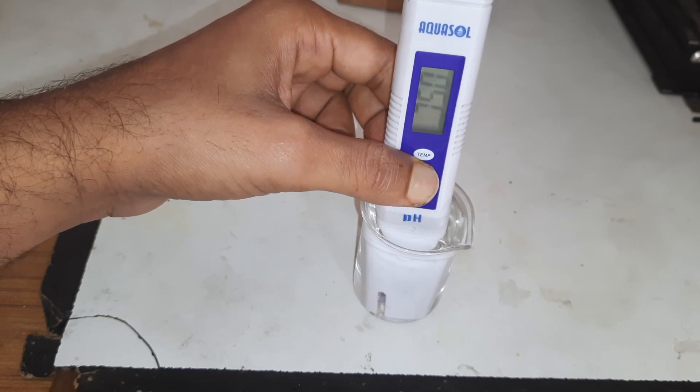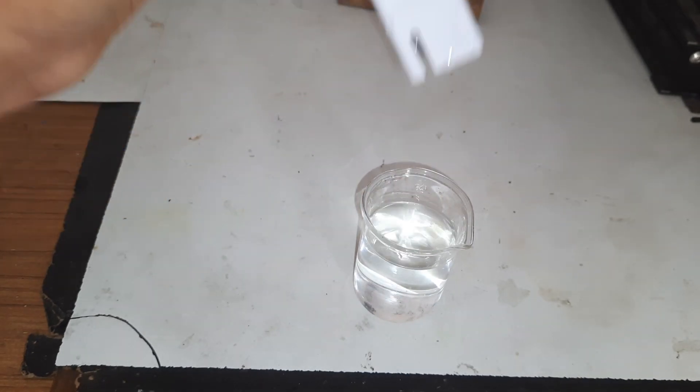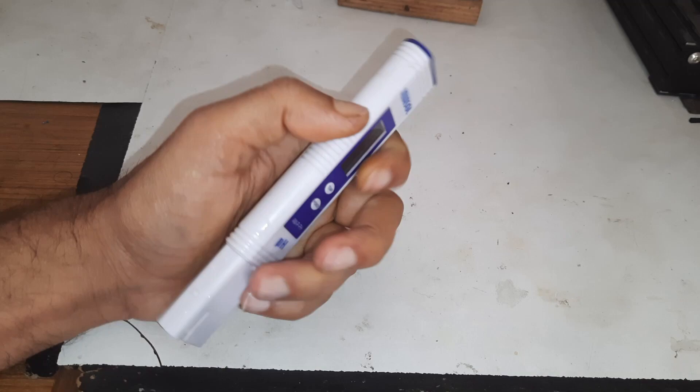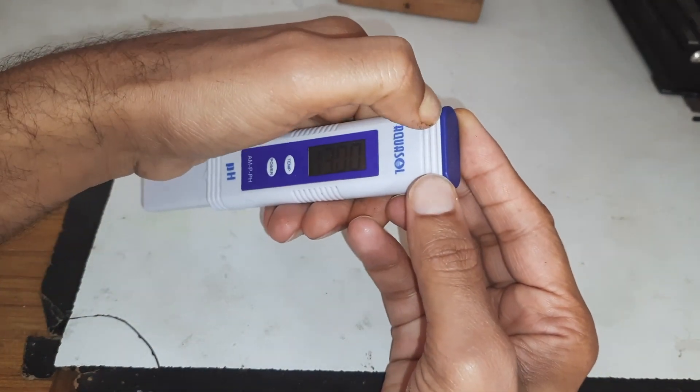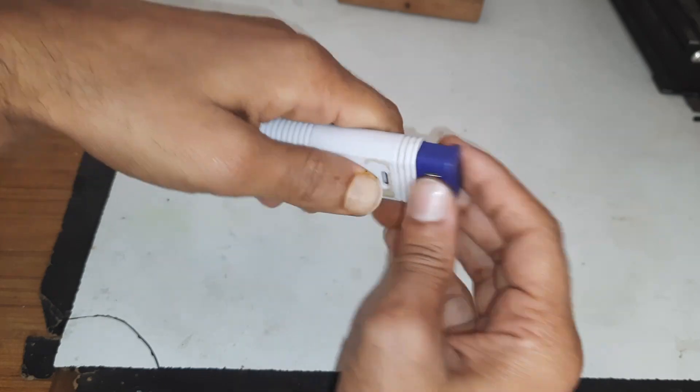It's around 7.5 pH, which is not bad. Now let's see what's inside — it is two button cells to power this meter.